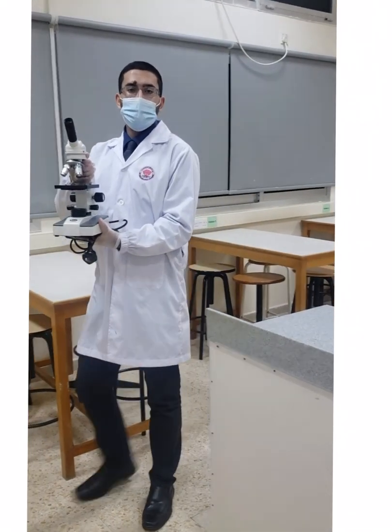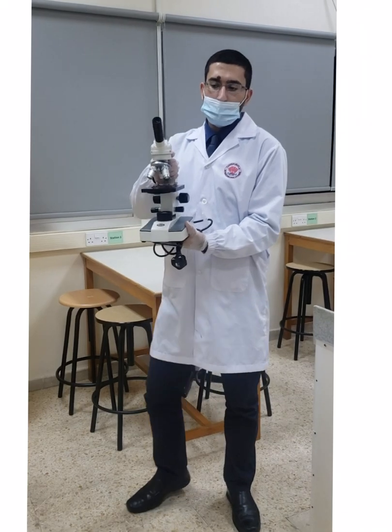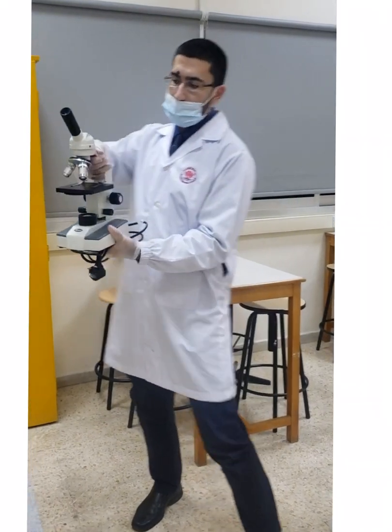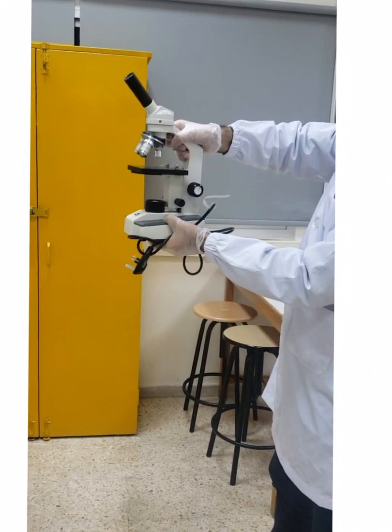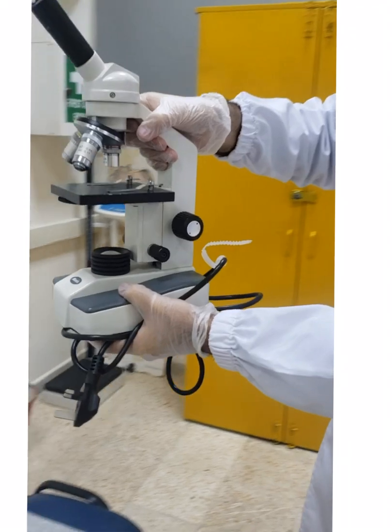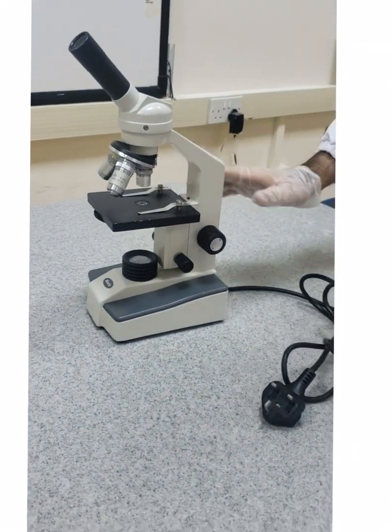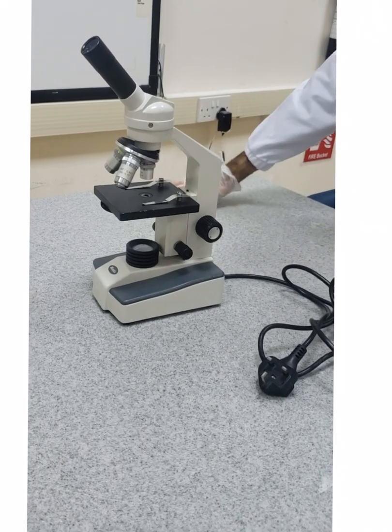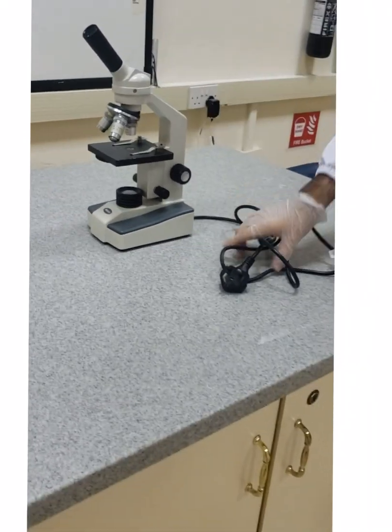So there are some rules that you should know before using the microscope. When you bring the microscope, you should handle it from the arm and from the base. One hand on the arm and the second on the base. Okay? When you bring the microscope, put it in the middle of the table. Keep the microscope away from the edges of the lab table. Put it in the middle.